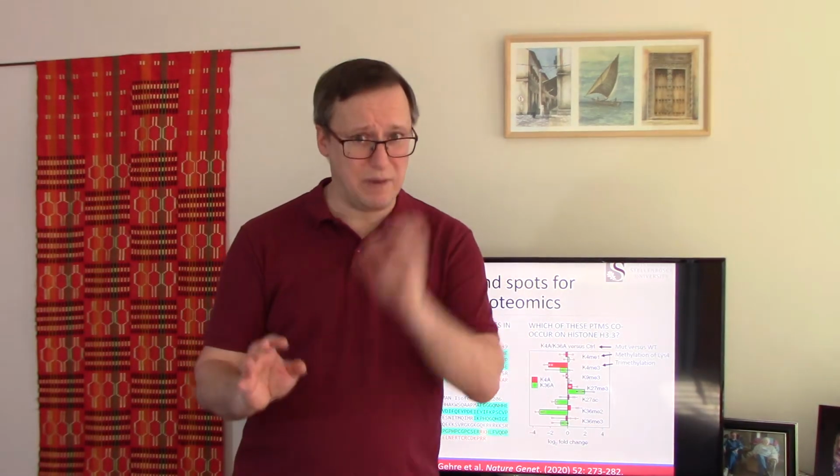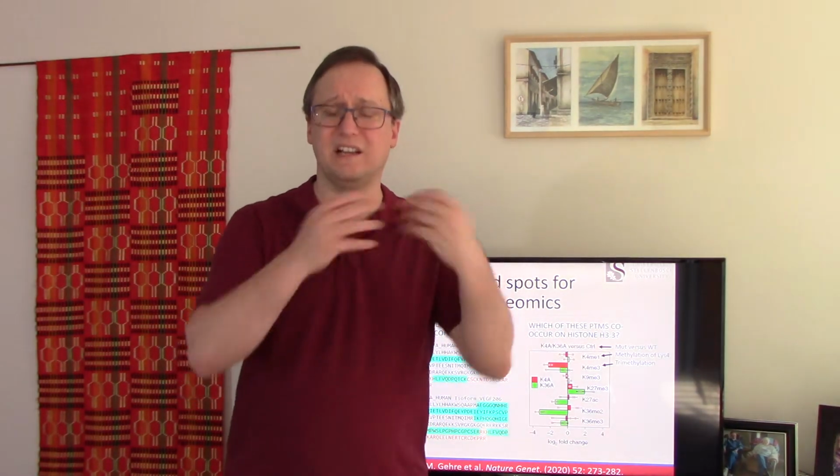Our unit of measurement then is the peptide. The peptide comes into the mass spec, it's collided with gas, it blows apart, it produces fragment ions, we measure those in a tandem mass spectrum and we identify them. That's grand. But what's the shortcoming of this?